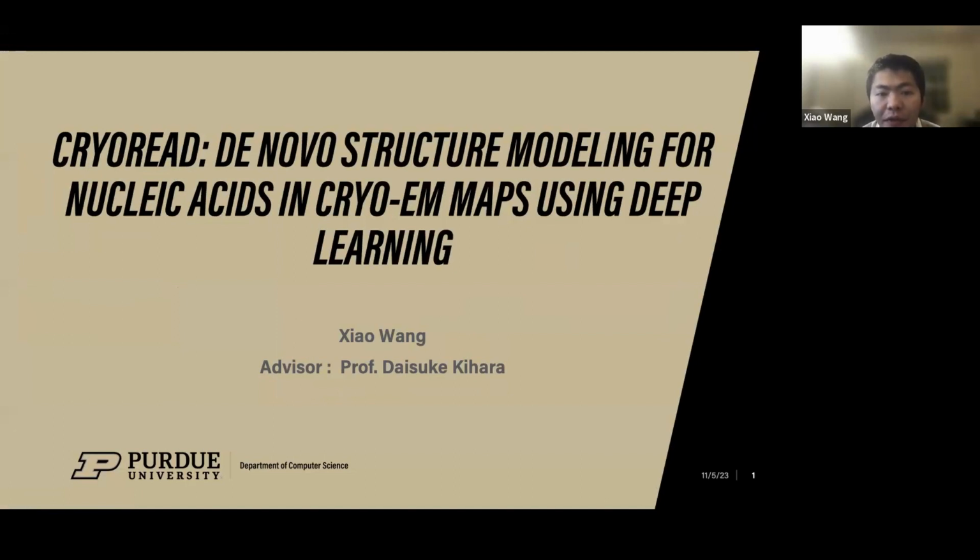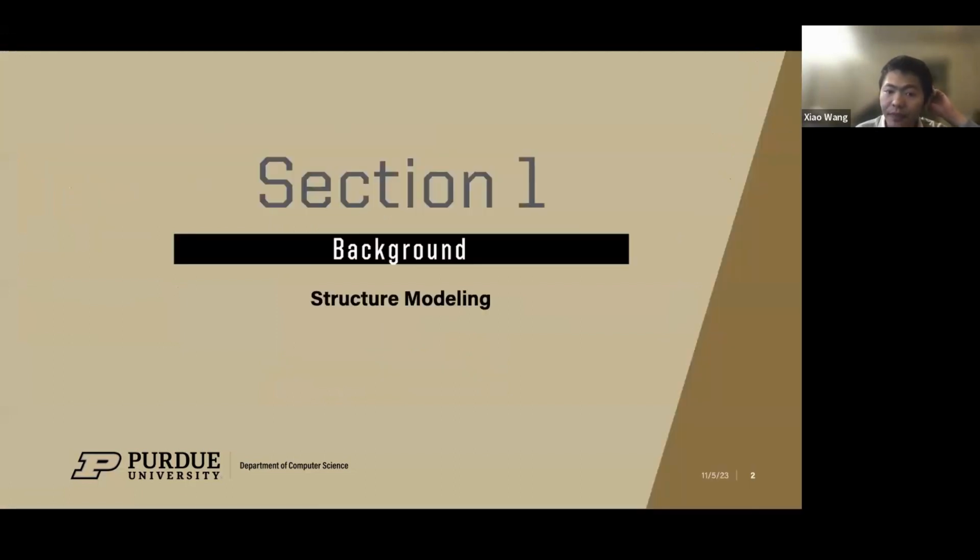CryoREAD is a method for de novo structural modeling of nucleic acids in cryo-EM maps using deep learning. First, I will briefly introduce the background of structural modeling.